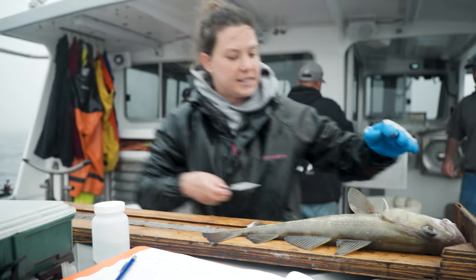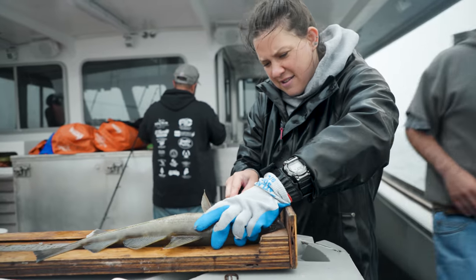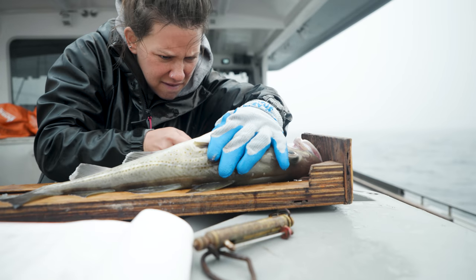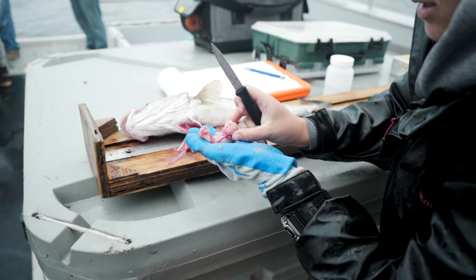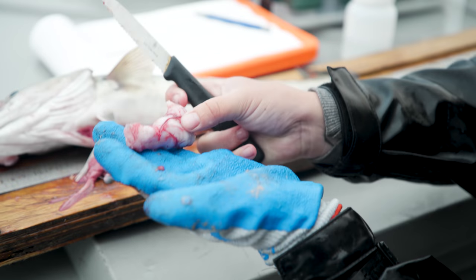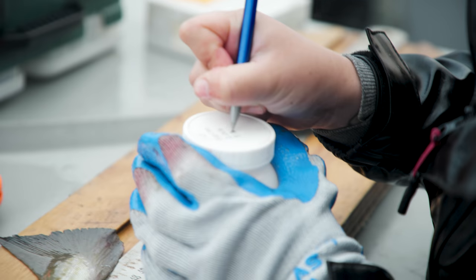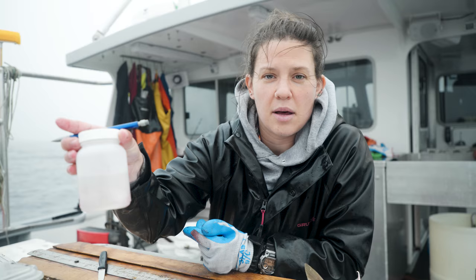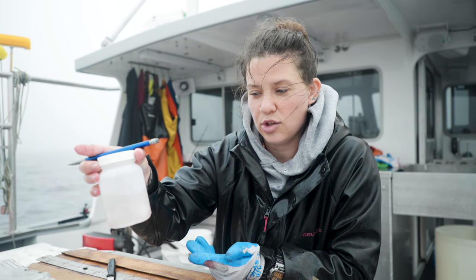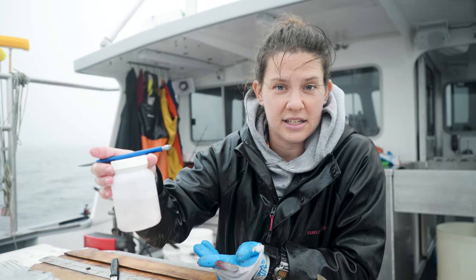Now we're gonna take the stomach out. Here's the stomach — it's hard to tell, but there's probably something in there. This is 95% ethanol, so basically this will preserve that stomach until I'm ready to cut it open and analyze it.